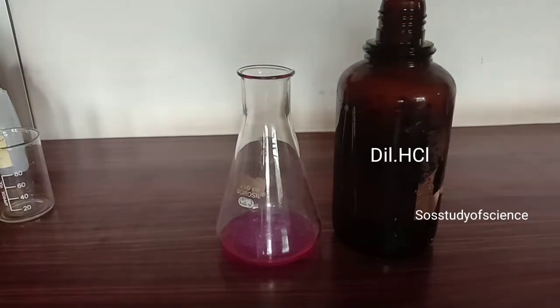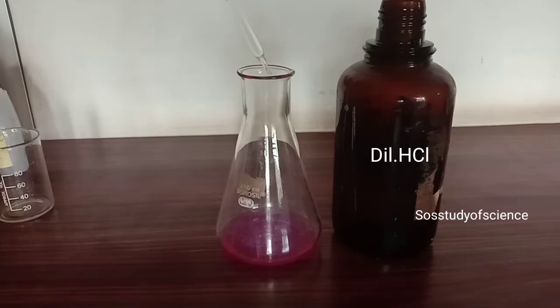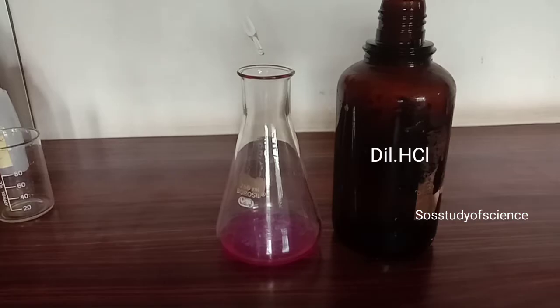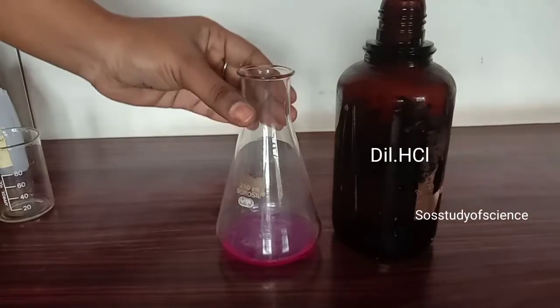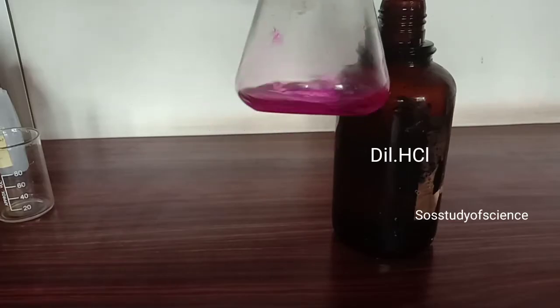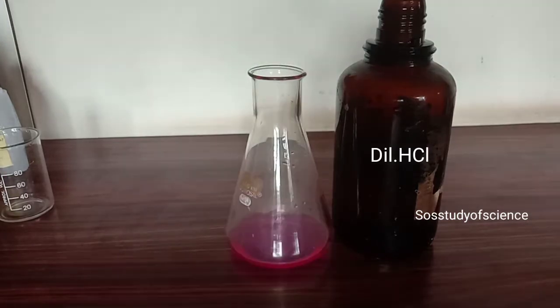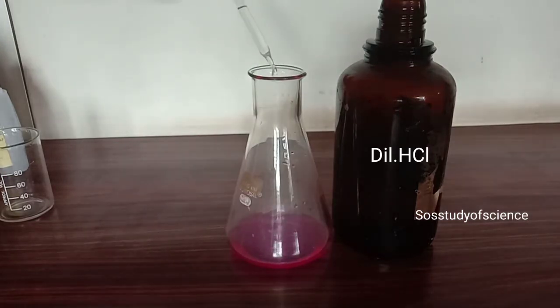Now take dilute hydrochloric acid with the help of a dropper and add it drop by drop to the conical flask. Take the conical flask and mix the solution. You can notice the pink color in the solution does not disappear — it is because there is still presence of NaOH, which is a base, in the solution.